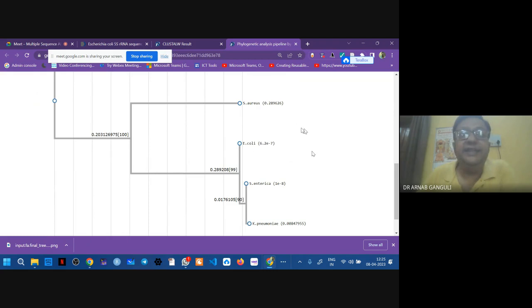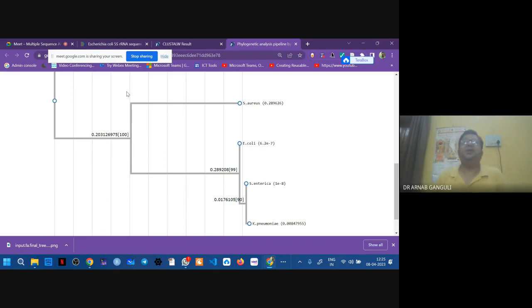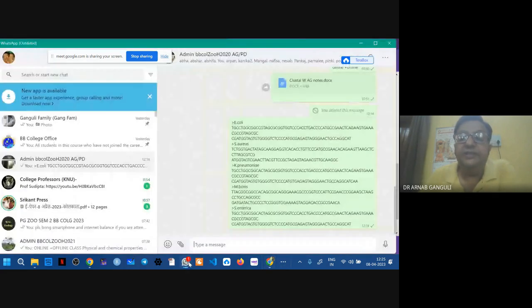Okay? Yes, sir. Okay, then write it down. Look at the video, how it is done. I have sent you the Word file of the sequences already. Everything is written step by step there. And I am sending this picture and another PDF. Then you will have everything. Just hold on before you leave. Let me send you the details first.